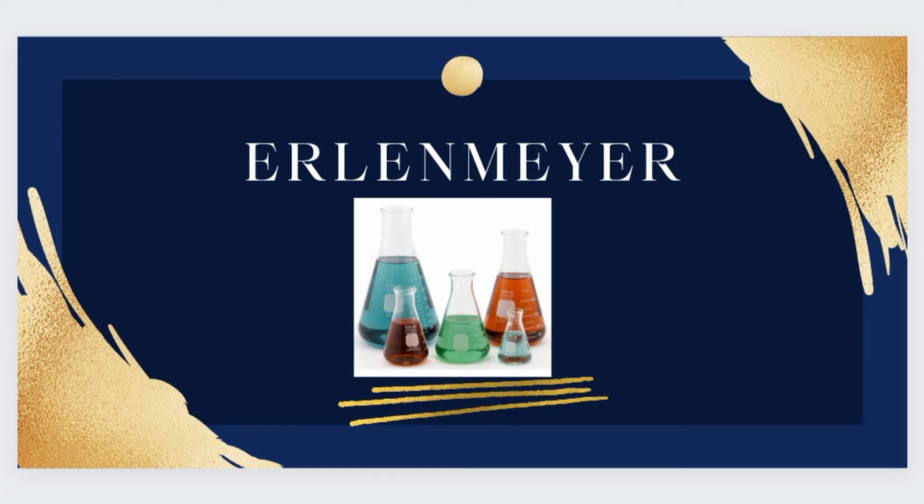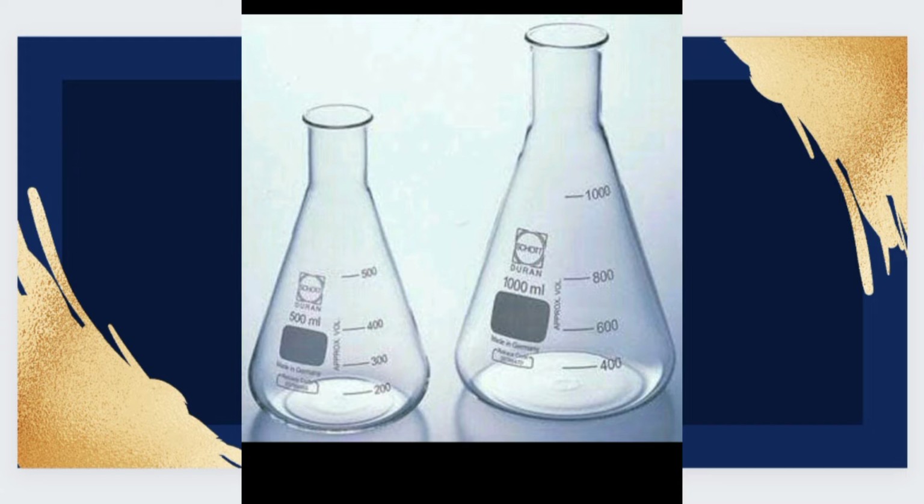Erlenmeyer is made of borosilicate glass, so it can be heated over a fire or in an autoclave. Erlenmeyer has variant sizes, including 50 ml, 100 ml, 125 ml, 250 ml, and 1000 ml.